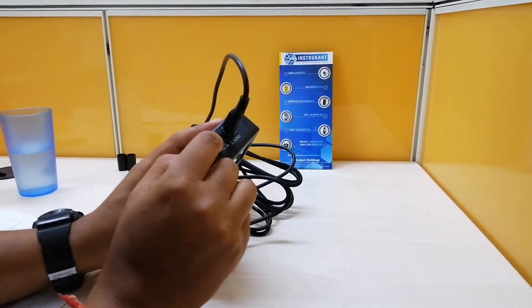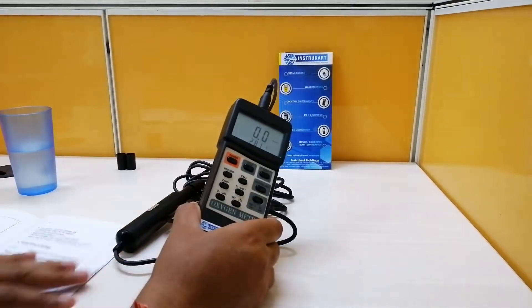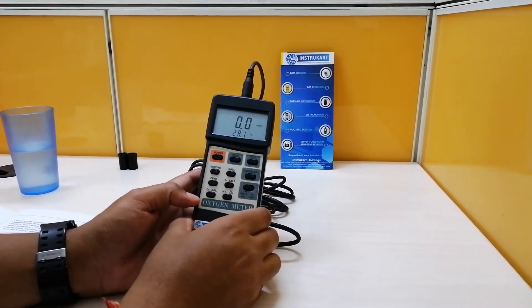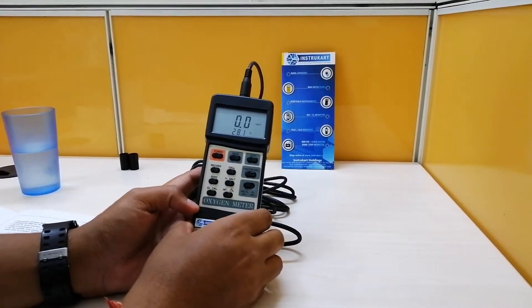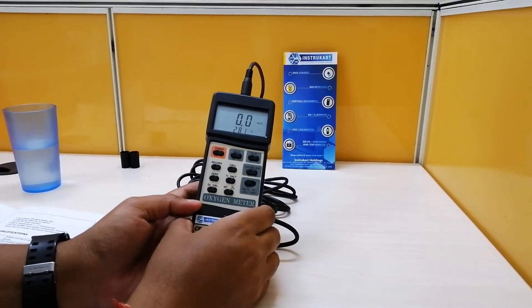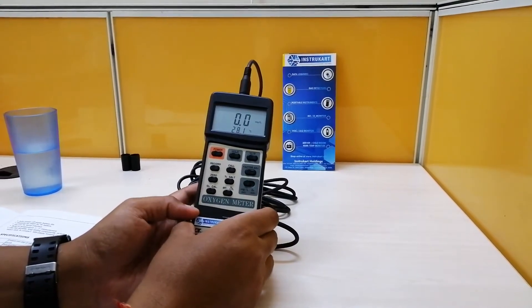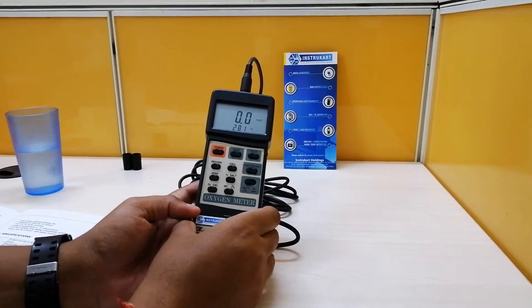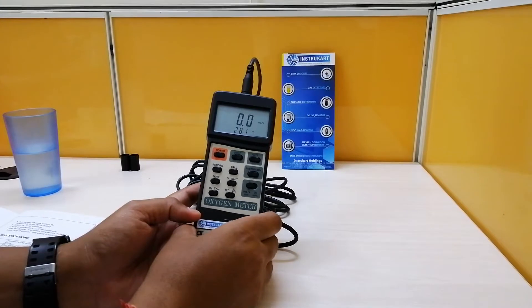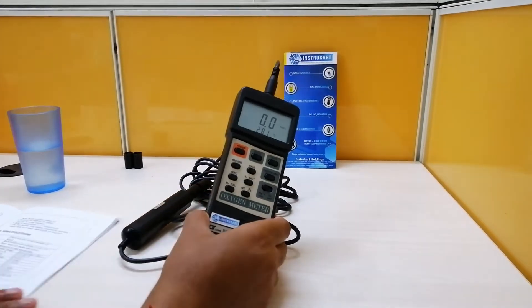It also has an RS-232 output for PC connection. For accuracy: the dissolved oxygen range is 0 to 20 mg per liter with accuracy of ±0.4 mg per liter. For oxygen in air, the range is 0 to 100% with accuracy of 0.7% O2. For temperature, the range is 0 to 50 degrees Celsius with accuracy of 0.8 degrees Celsius.